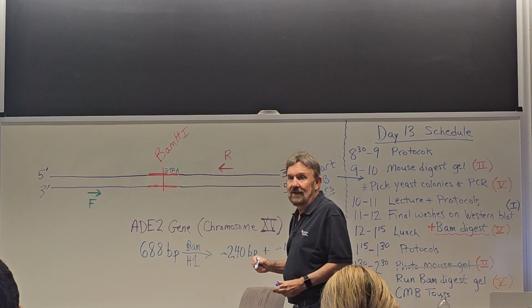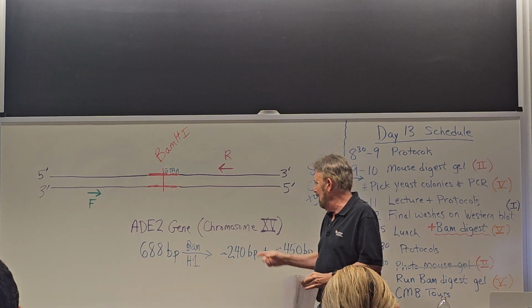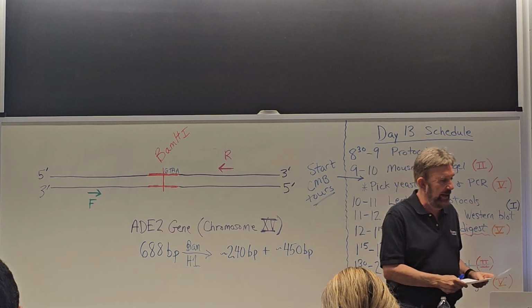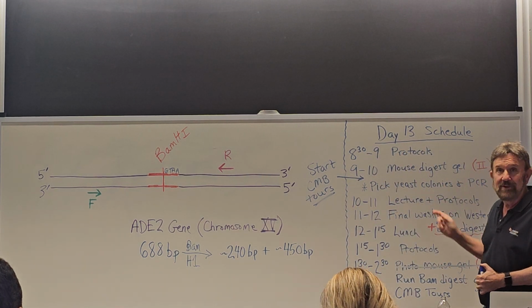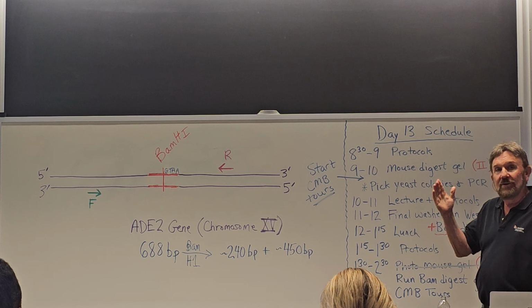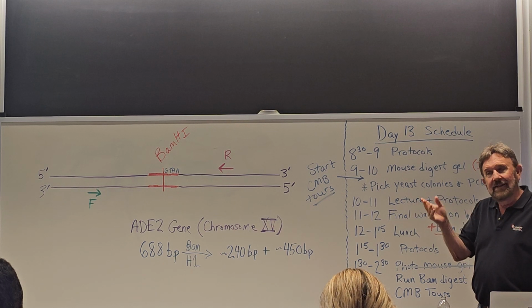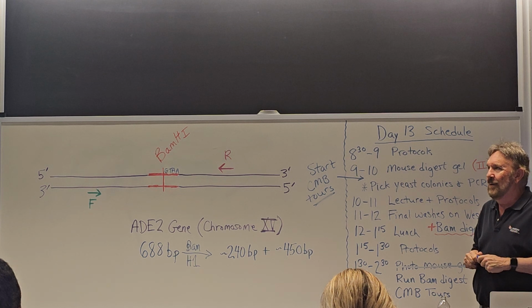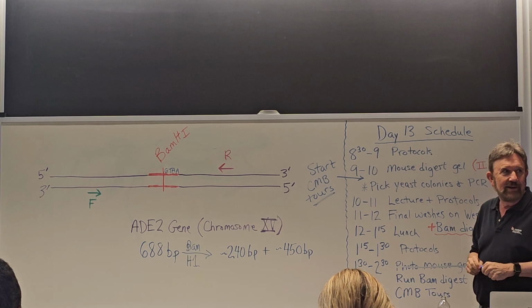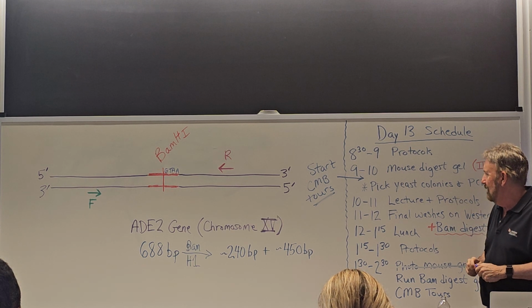And from our 3 pink colonies that we saw yesterday, we saw in fact that we did get those 2 fragments when we cut the PCR product, and hopefully we'll see more of that again today, because you redid your PCR, and then we took the PCR product and just cut it with BamHI, and now the staff's running that gel, and we'll see those results later on.